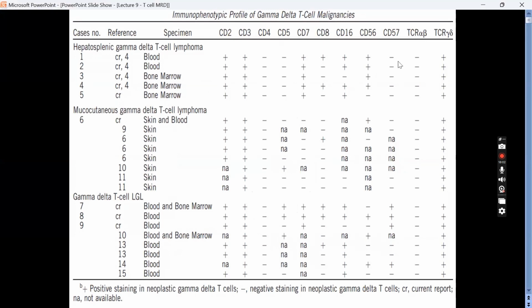Now you've gated the CD45 mature lymphoid population. I've not shown you a very sequential gating, I've just shown you the T tube. In the T tube, the cells you've gated, 92% of the lymphocytes, are co-expressing 16 and 56. Cells which express 56 and 16 are commonly NK cells, correct? So you have expanded cells showing more of an NK cell phenotype, 16 and 56 positivity.